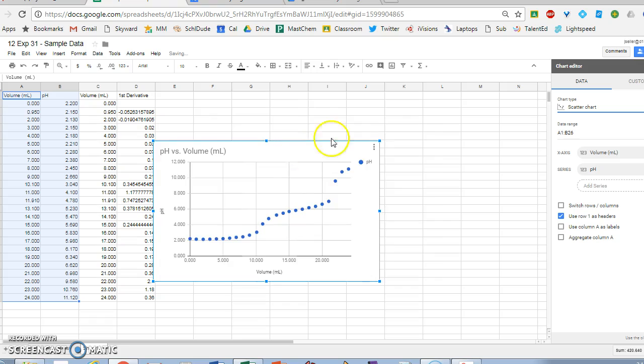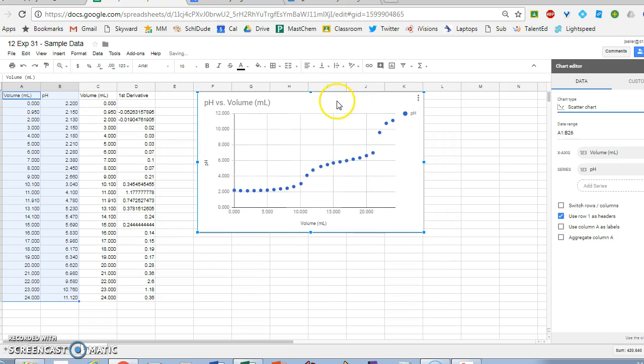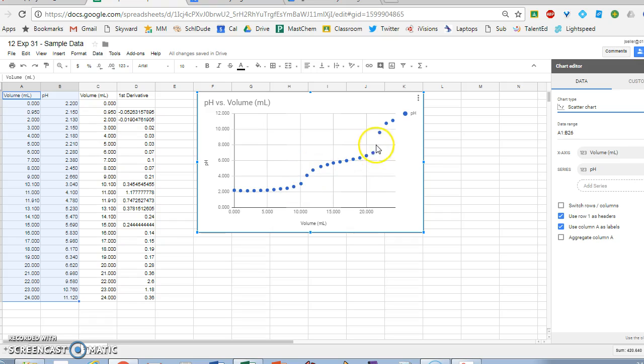There's my pH versus volume, and you can see there's my first equivalence point (that jump there) and my second equivalence point (that jump there).